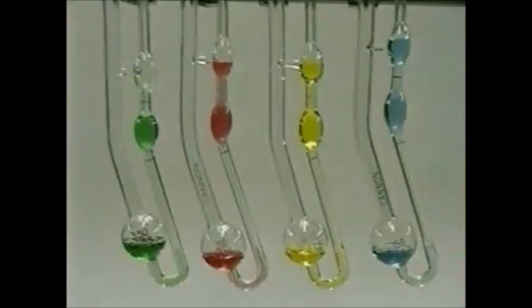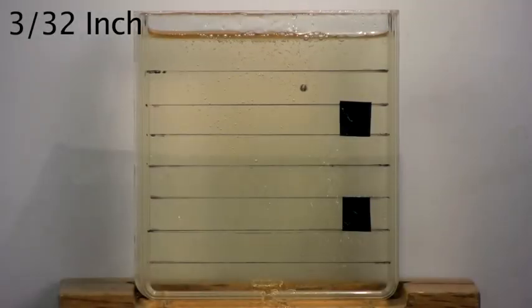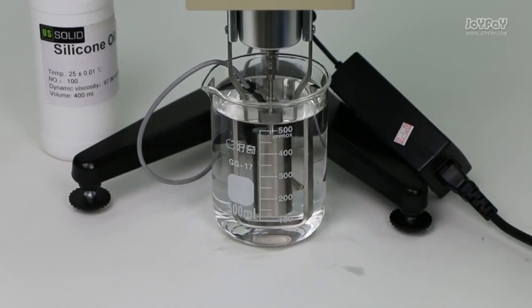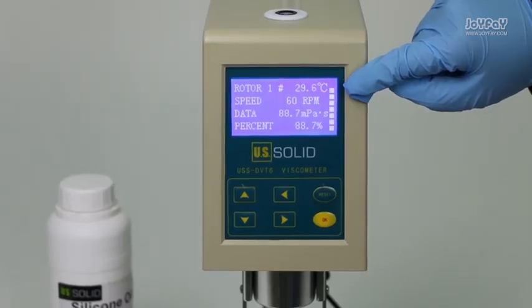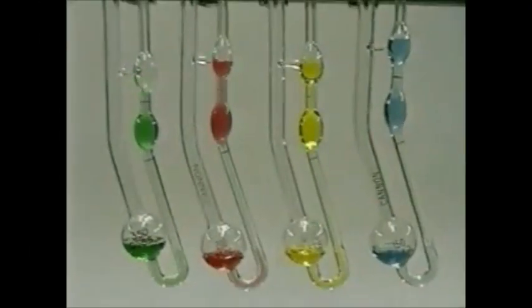In determining the viscosity of fluids, the following methods are possible: flow through capillary tubes, fall of solid spheres through fluids, torque or viscous drag on a rotating disc or cylinder immersed in the fluid, and flow of fluids in an aperture plate. The first enumerated will be the method used in this experiment.